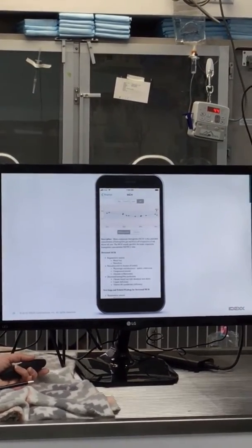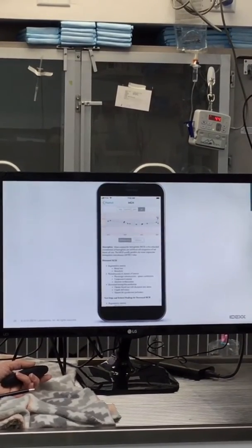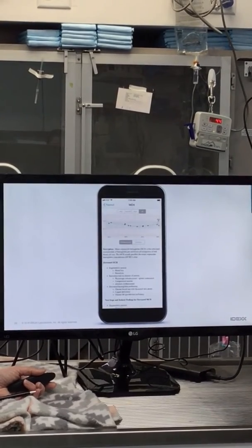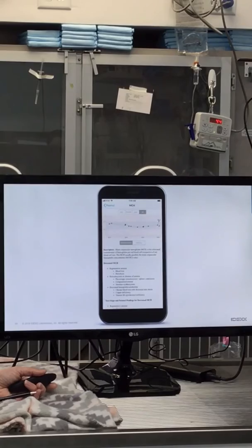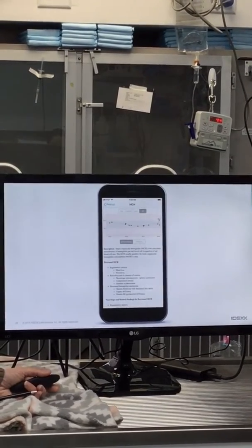I mean, this is great for y'all, but it's also good for the doctors, if it's something strange. Now, I know that y'all help different doctors different days. You can actually change it so you're only having the doctor you're working with results come across. All you do is hit personalization and select the doctors that you want to see.